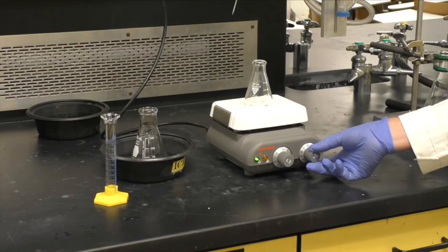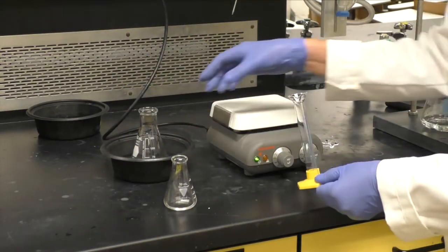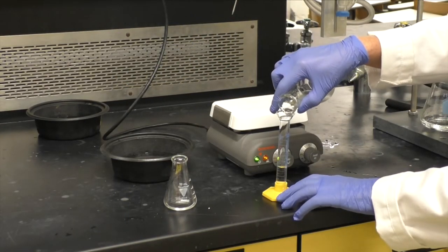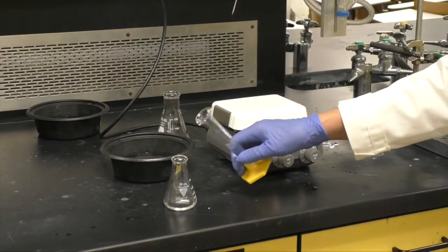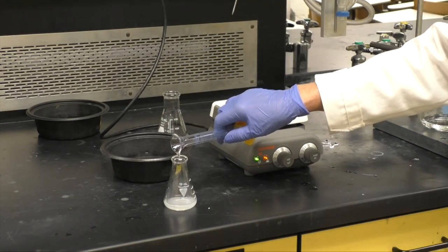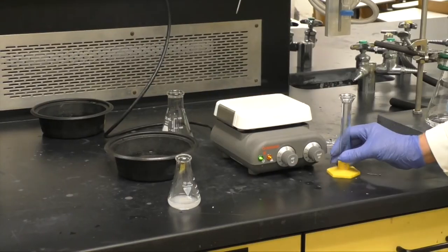Once the solid has dissolved, immediately remove the flask and add 6 milliliters of chilled water. Crystals will begin to form. After about 5 minutes, move the flask to an ice bath.